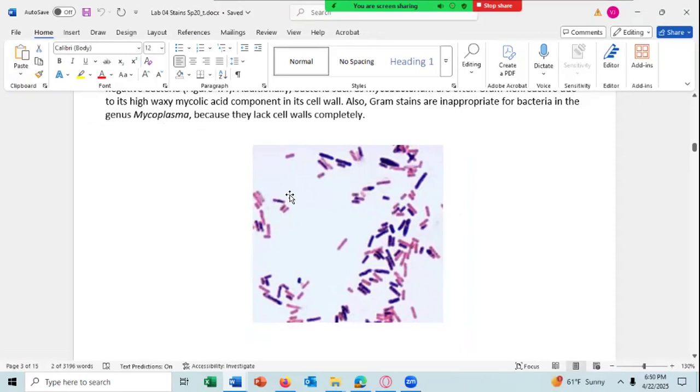What's happening is these cells are dead. That's why that cell looks ghostly and why that cell looks like it's broken. These cells are dead, and the dead and dying cells are staining pinkish, or maybe they're just all dead. And then the cells which are viable are staining purple.